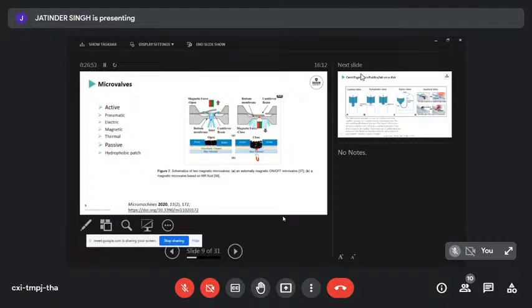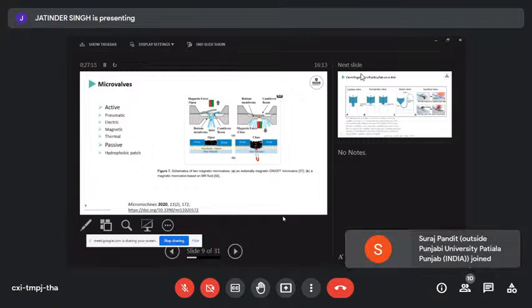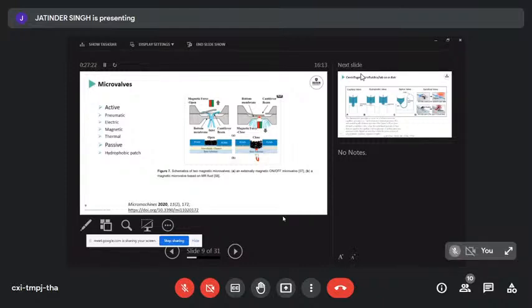Hydrophobic patches are really useful because, in a microfluidic system, the pressure you need to overcome to progress in a channel depends on the wetting. We just spoke about capillarity and the fact that liquid wets a glass capillary or a glass microchannel by itself. If you functionalize a little ring to make it hydrophobic, then all of a sudden the pressure that you need to overcome increases and your liquid doesn't want to wet the walls anymore.